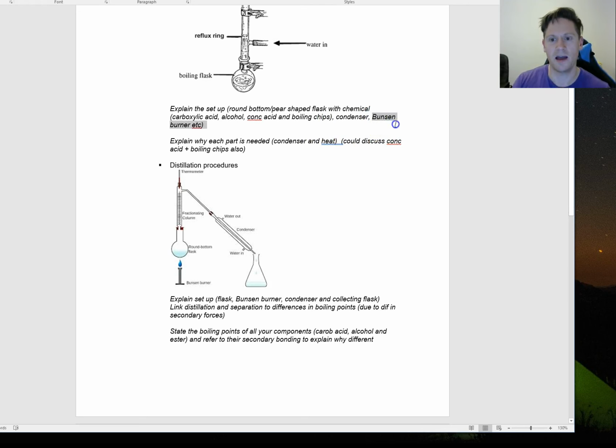You can talk about how successful it was using the Bunsen burner with the tripod setup to get that temperature control for that gentle boiling. You can talk about how long you heated it up for, 30 minutes. You might find that it's probably better to heat for longer, and that's part of the weaknesses or the limitations of the practical, the fact that we didn't reflux probably for as long as we would have liked, but that's the time restrictions we've got in a high school.